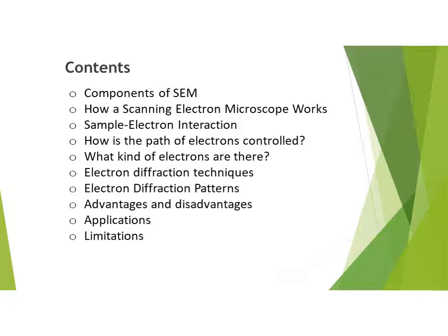During my presentation, I'll throw light on the topics: components of scanning electron microscope, how a scanning electron microscope works, sample electron interactions, how is the path of electrons controlled, what kind of electrons are there, electron diffraction techniques, electron diffraction patterns, advantages and disadvantages of scanning electron microscope, and then applications and its limitations.